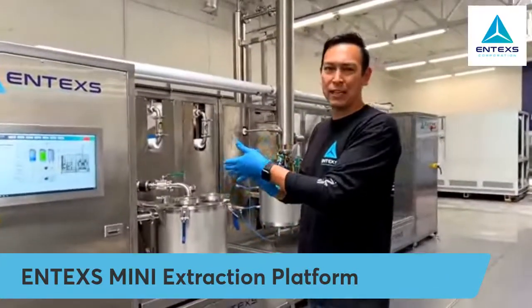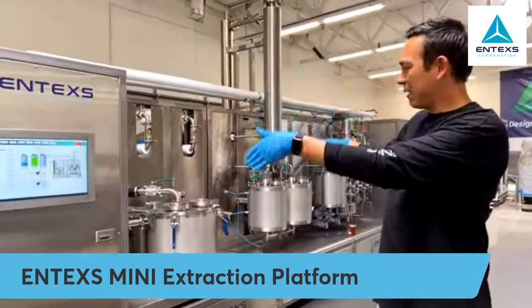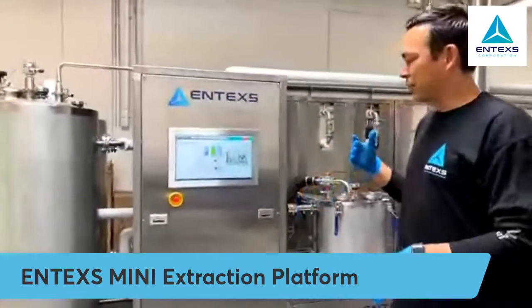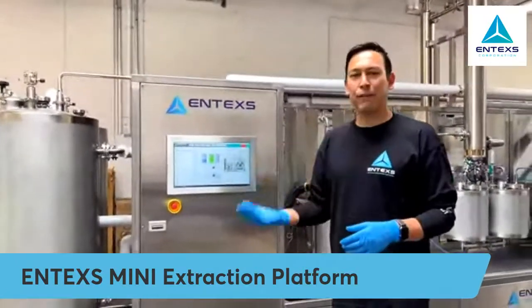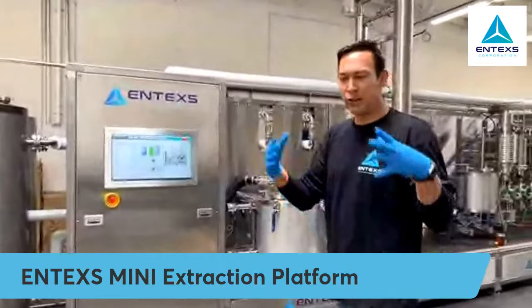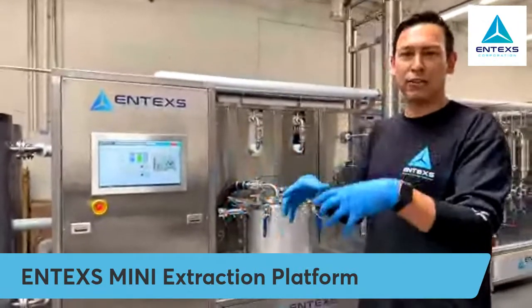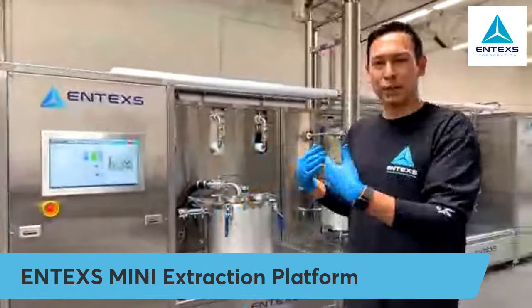The way we've designed our mini-series of products is we've put these into a segmented array that allows them to be custom-engineered into a customer's facility. It also allows these things to be integrated together so you don't get any open ports, open containers, transfers, or inefficiencies associated with that. We're trying to address the traditional ways of extraction where you have to take product from extraction, transfer it manually over to rotovaps, vacuum ovens, and distillation stills — combining all that into one integrated piece of equipment with one input stream of biomass and one output stream of crude indoor distillate.